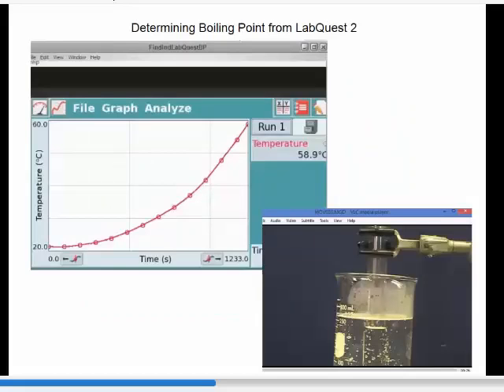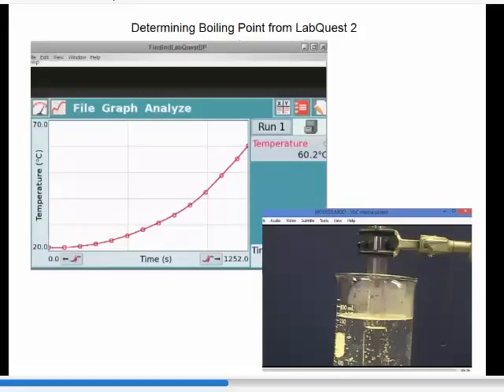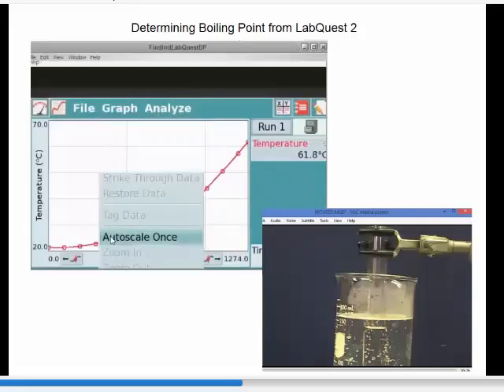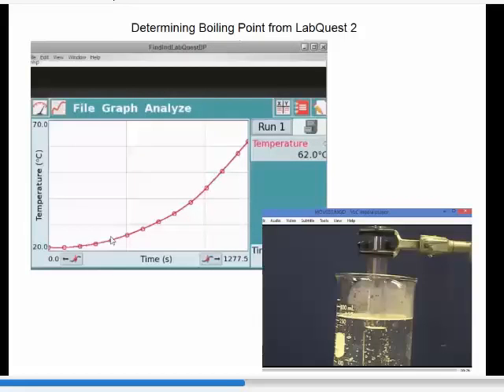And what you'll see is we've gone through 1,233 seconds or so. Remember my 900 I set it for? Well, that wasn't enough. So all I had to do was when it ran out of 900 seconds, I just hit the green arrow that would show up in the left corner, told it to append the data, and it just sticks it on top. The reason it was so slow for me was I was trying to manage all of my professional audio-video equipment. Temperature's going up pretty steeply. You can, while you're watching this, go up here and where it says graph, you can auto-scale it. It makes it more exciting.